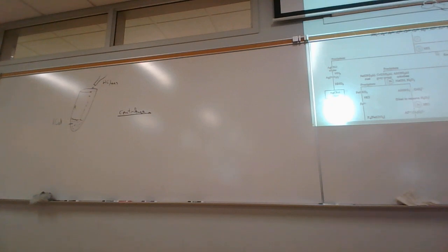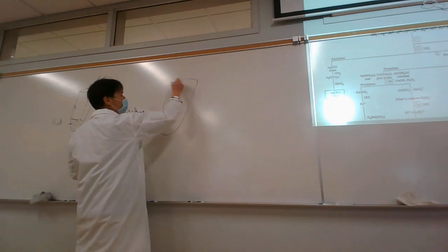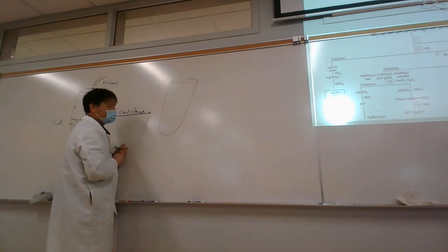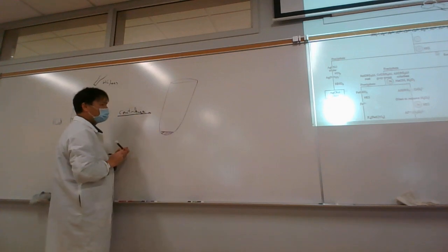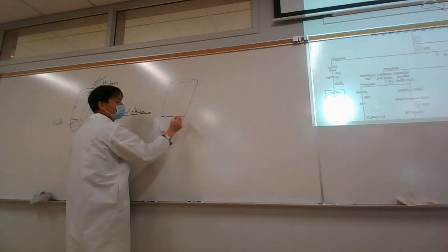You can get a piece of paper towel, or just slow it by gently applying friction to the black ring here. You don't want it to come to an abrupt stop. Just let it come to a gentle stop here. Then remove your sample. After we centrifuge it, that's going to compact the precipitate down here. And then we end up with a clear solution up here.